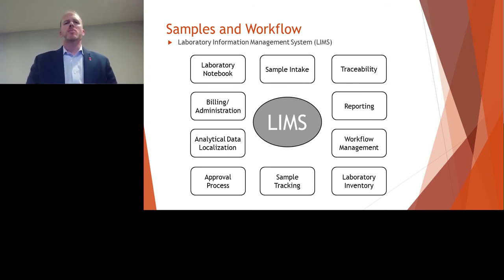So with a good LIMS system, you are able to track your sample from your intake all the way through to the end. And that's basically what traceability is. And I'll talk a little bit more about that. Especially in the cannabis industry, traceability is a very important component because of all the regulatory issues that could come in. But a LIMS system will help as you bring a sample in, you log it into this system, and then a lot of them have a workflow function so that it can notify certain individuals that a sample is ready for them.